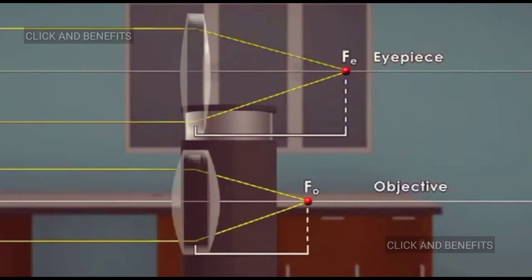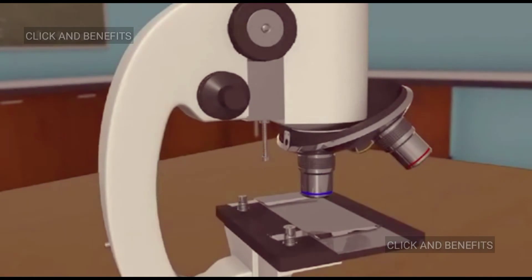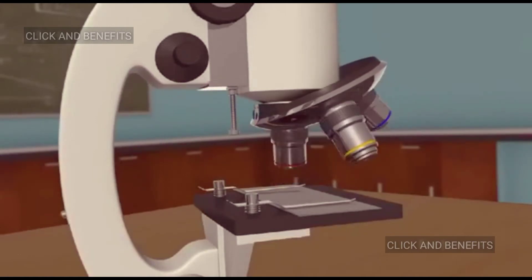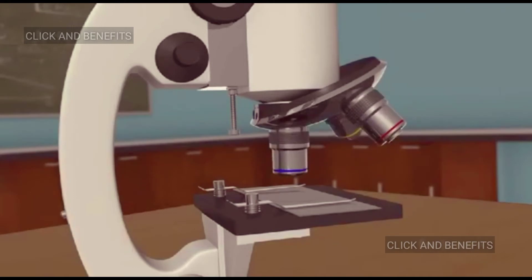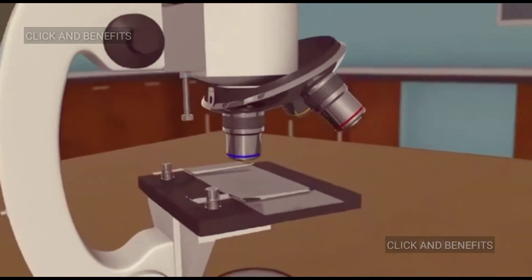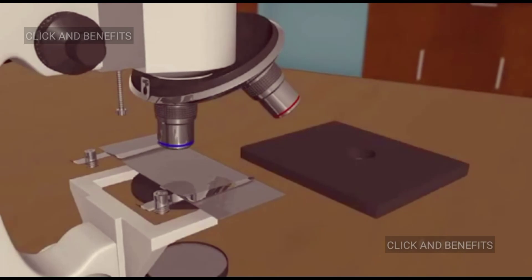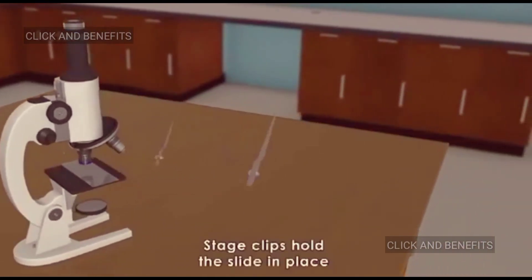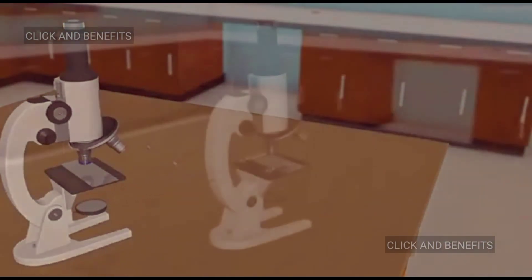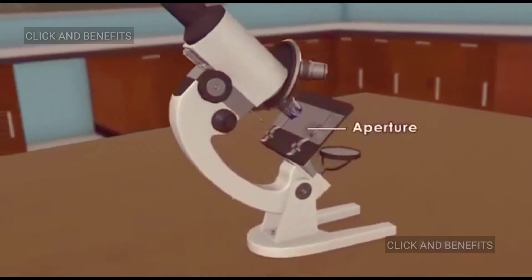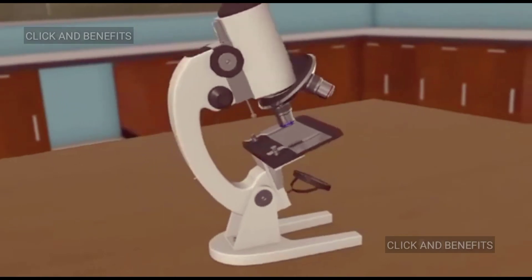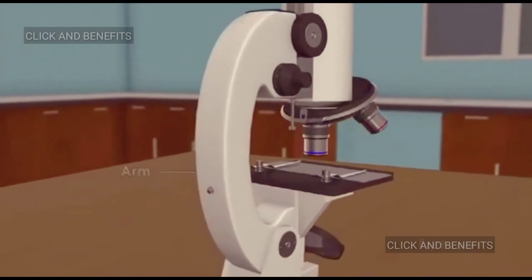Although the eyepiece also has a short focal length fe, it is still greater than the focal length of the objective. A revolving nose piece known as a turret is attached to the lower end of the objective. The turret can be rotated to change the power magnification as necessary. Below the objective sits a flat platform known as the stage. On the surface of the stage, two stage clips hold the slide in place. A small aperture is present in the stage allowing light into the body.